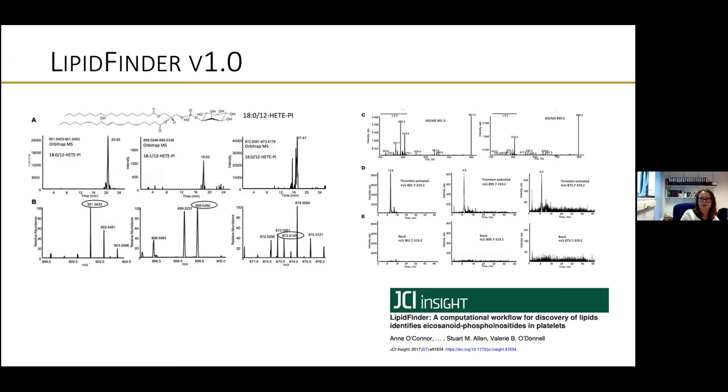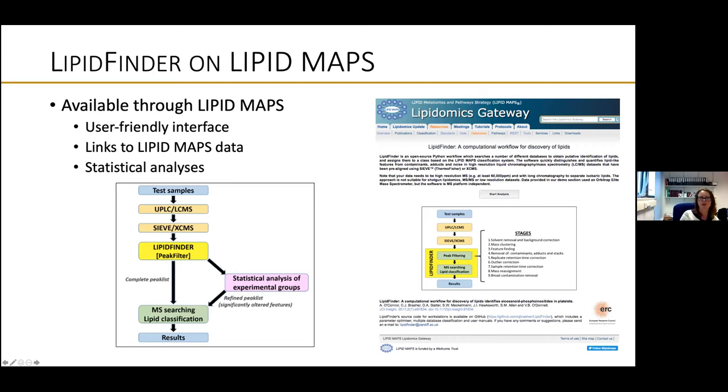And this is in one of the papers where we showed icosanoids attached to phosphoinositides. So it's HETE-PIs, also found using this approach, and there's MSMS done and chromatography. The Orbitrap peaks are not great, but peaks from the subsequent MRM runs are absolutely fine, and we've got nice MSMS, and we also have high resolution MSMS. So you really need to validate anything you do with this.